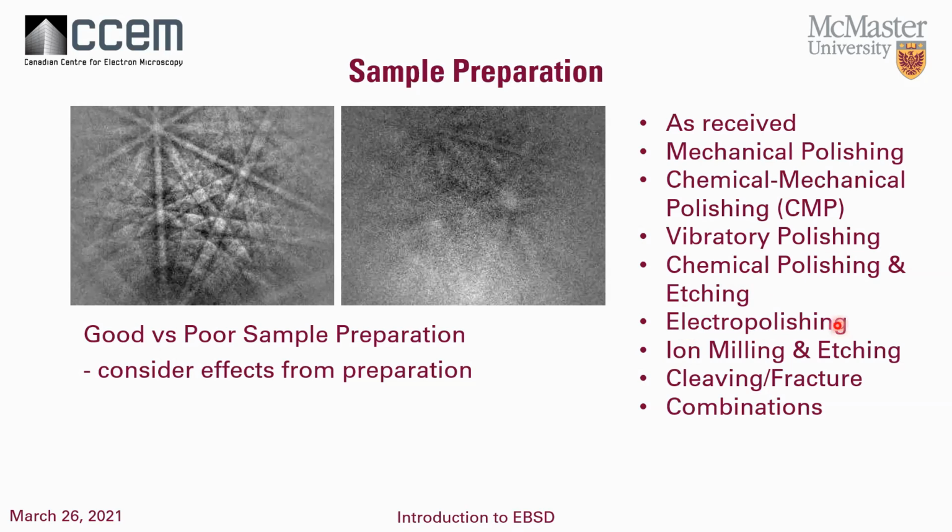Electropolishing, a lot of materials you can electropolish. It is more suited to things that are not multi-phased, because you do tend to get etching sometimes because of different dissolution times for things.